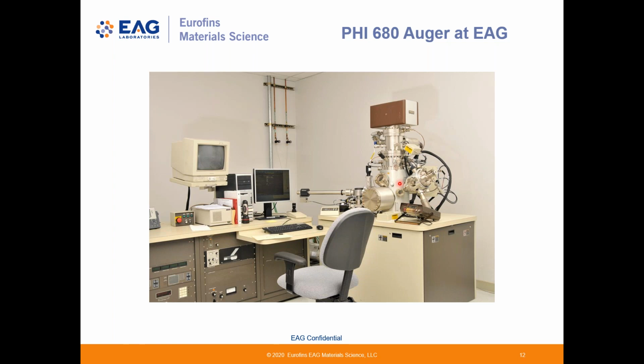These instruments are quite incredible considering you have to have very smooth stage motions and be able to minimize vibration to at least the sub-micron level, without using any grease or lubricants for the moving parts that would foul the vacuum. And we also need to get electron signals in and out of the vacuum chamber without introducing leaks. And you need to control fairly high voltages within a few tenths of a percent precision.